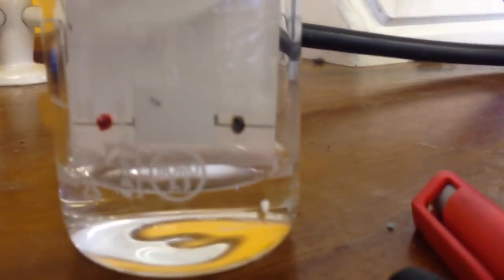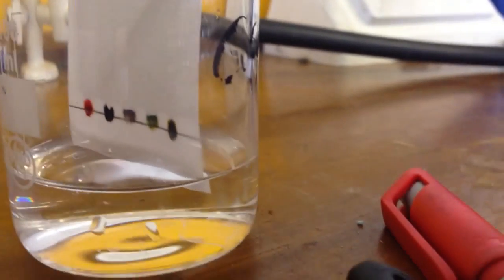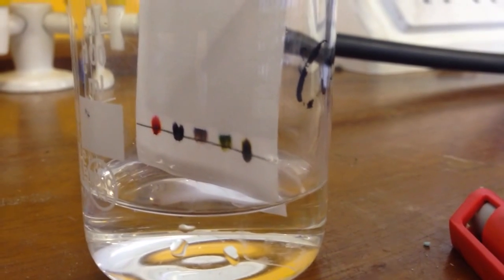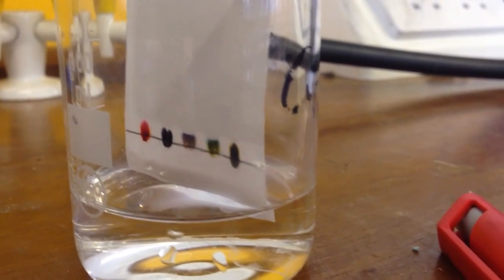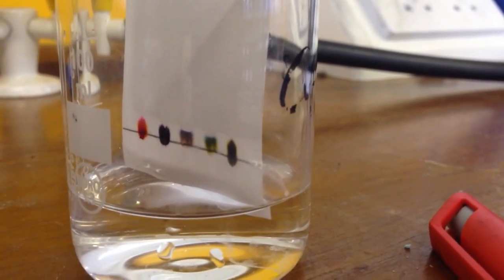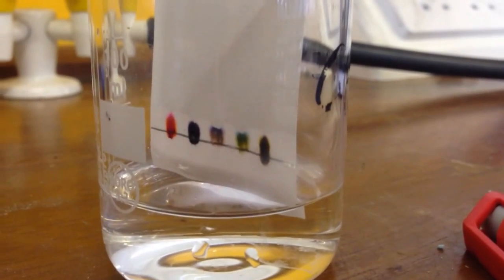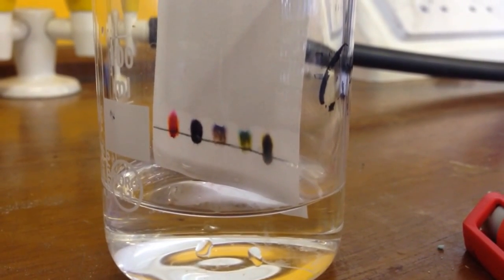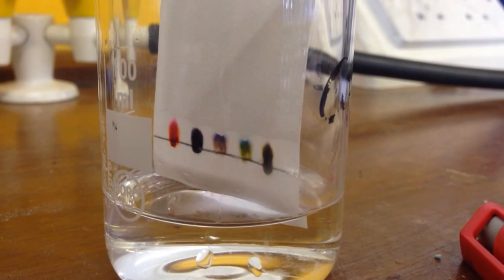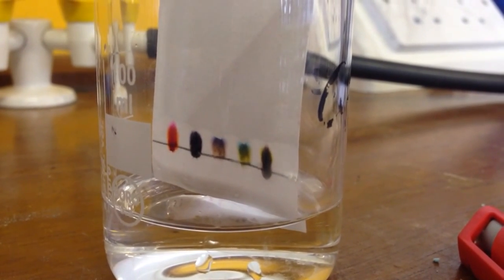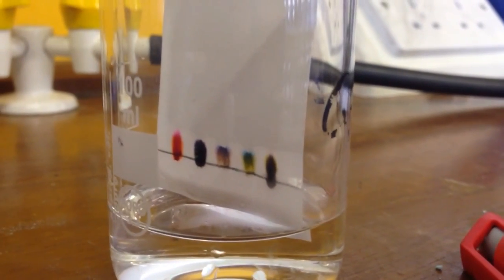We can see that the level of the water is in between the bottom of the paper and the pencil line, and we can see already that the colors are starting to move up the paper. We can see that it's starting to separate out. We'll come back to this once the water has moved all the way up to the top of the paper.